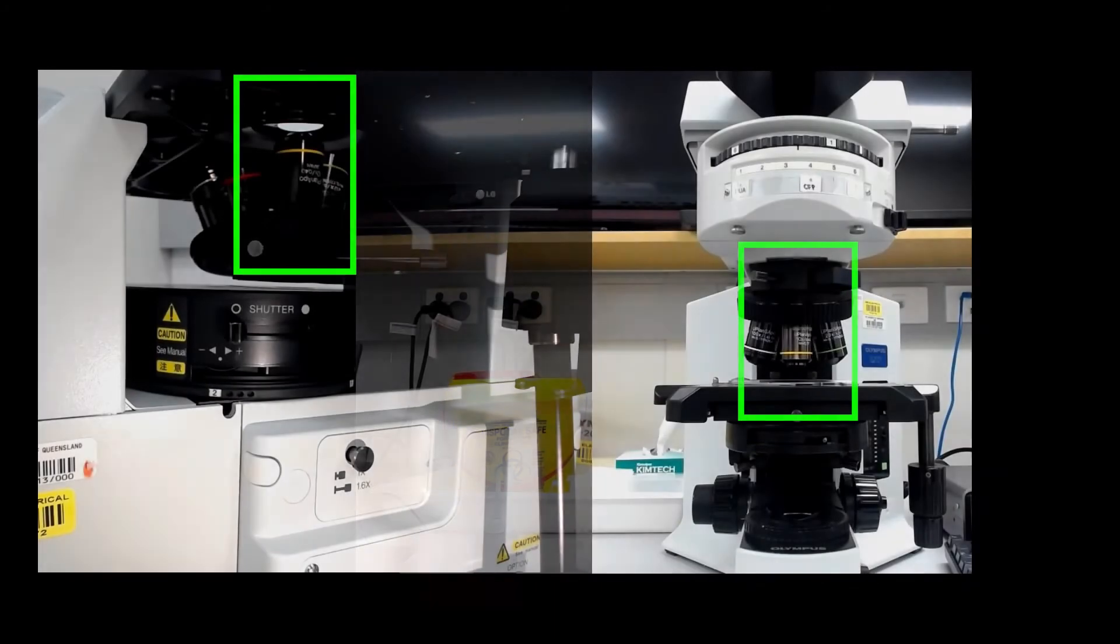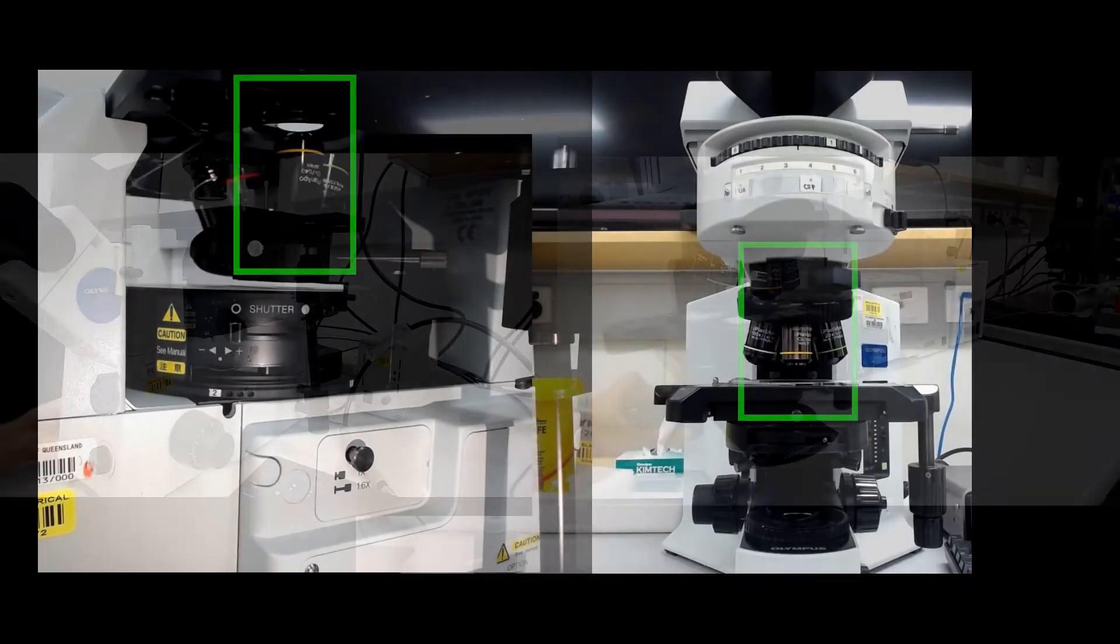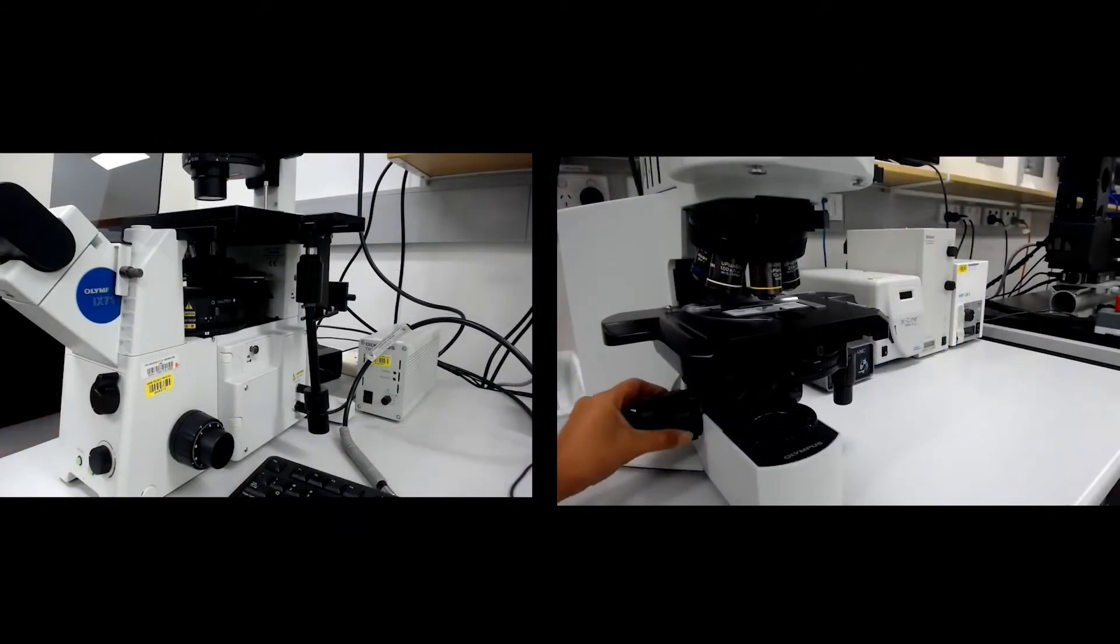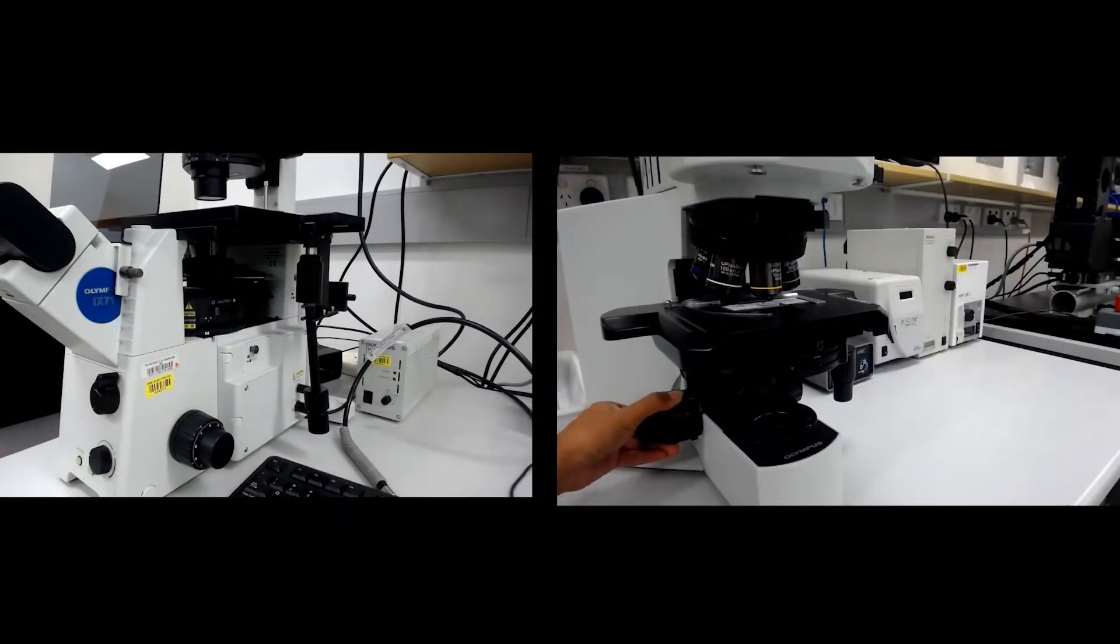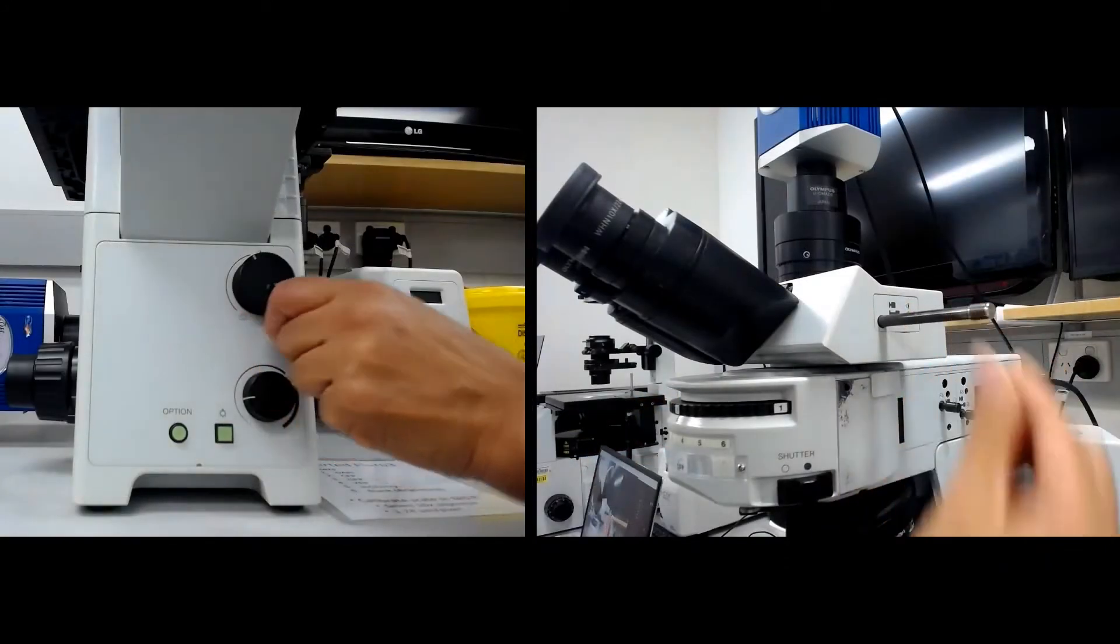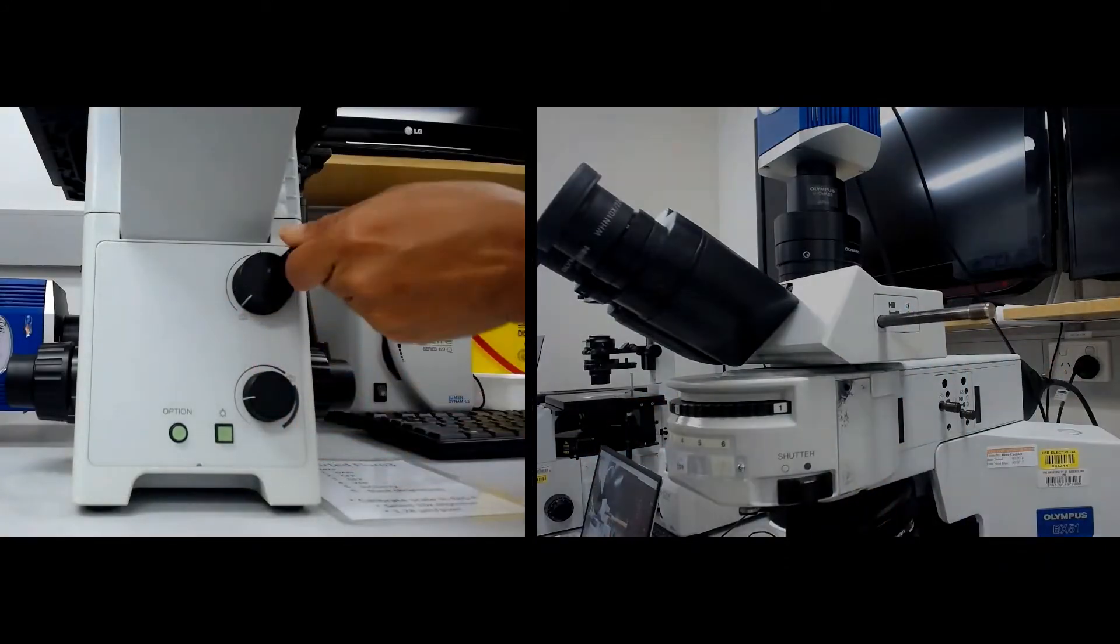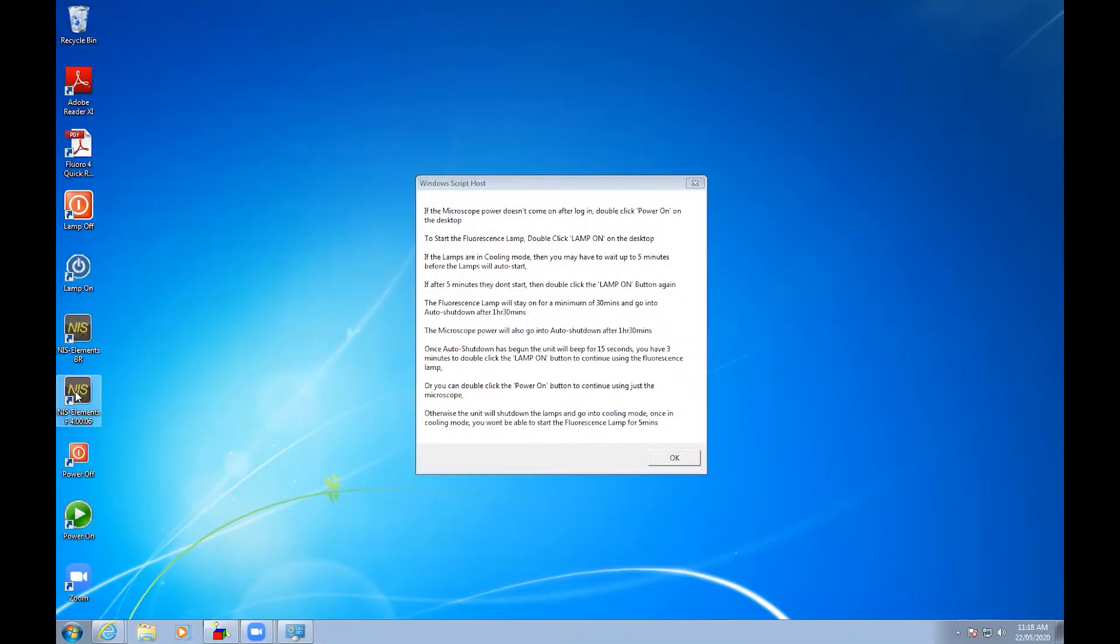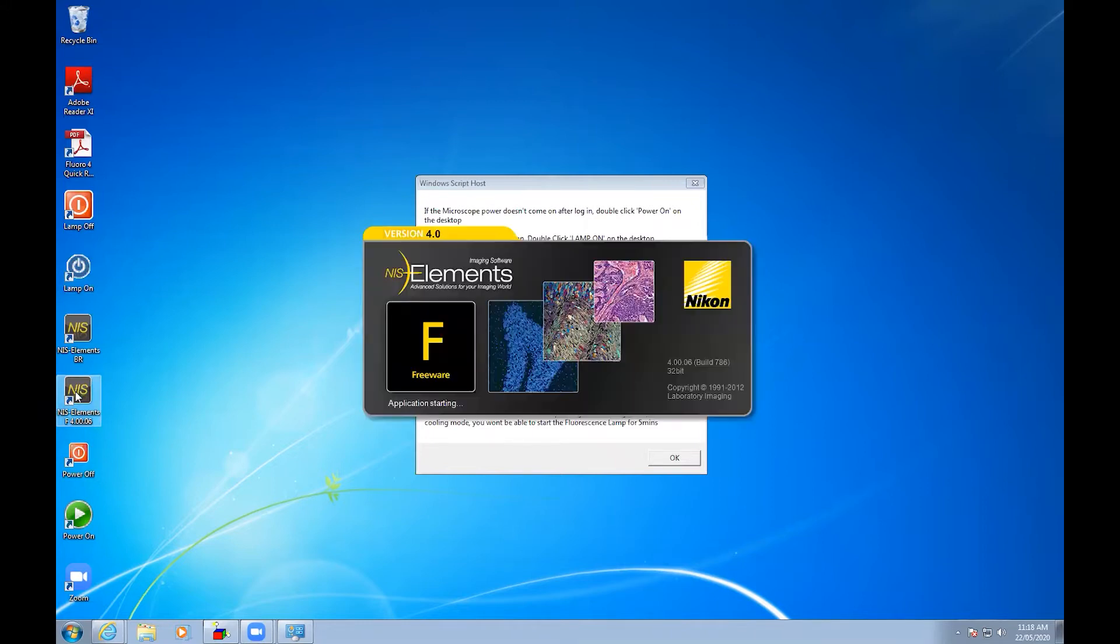Once you have chosen the magnification and adjusted the focus of your sample through the eyepiece, direct the light to the camera and move to the computer. Open the NIS Elements F program located on the desktop.